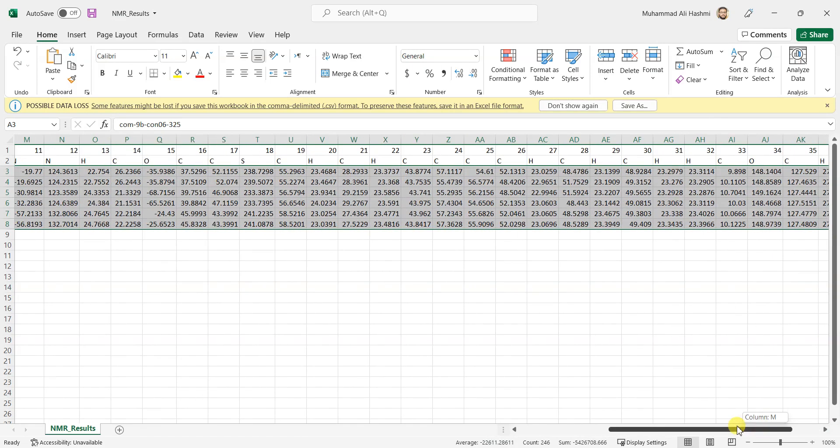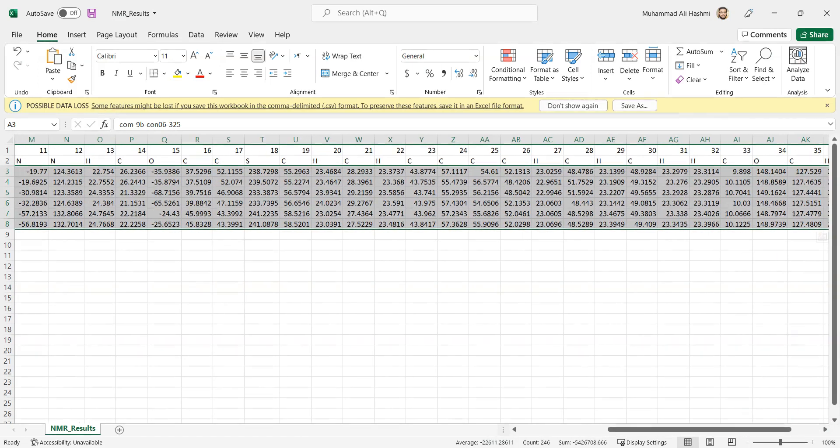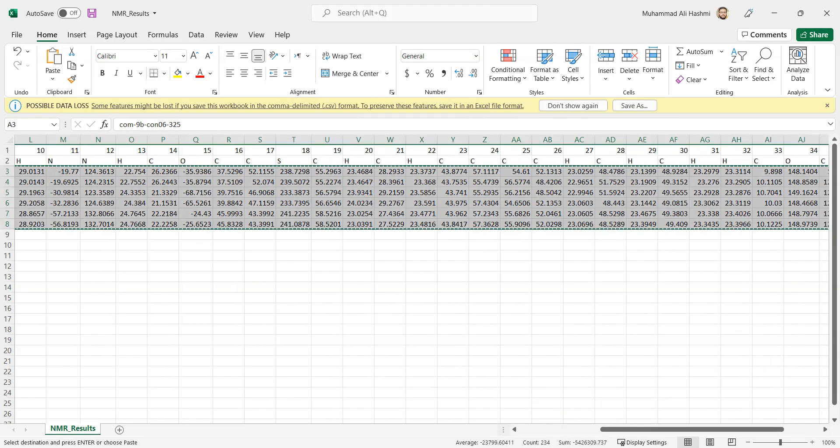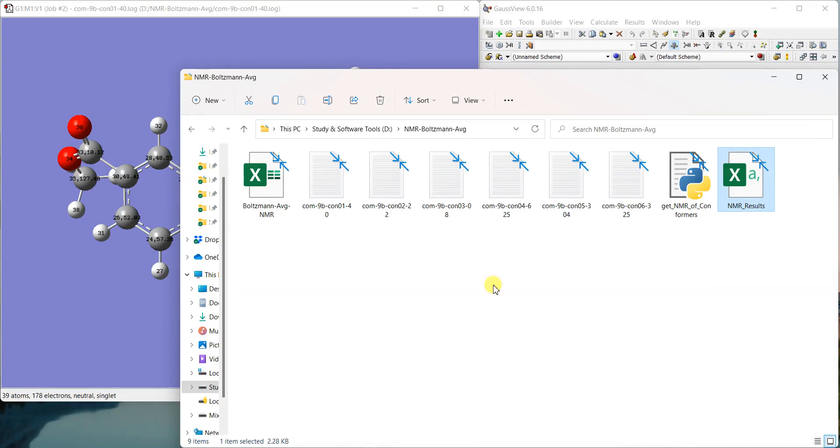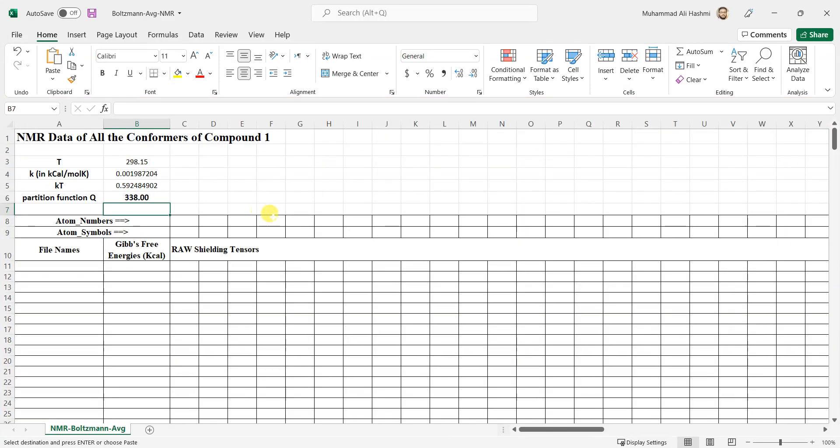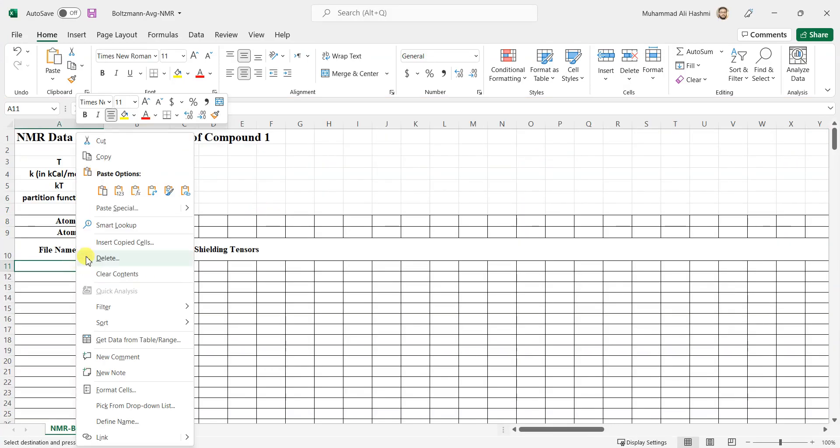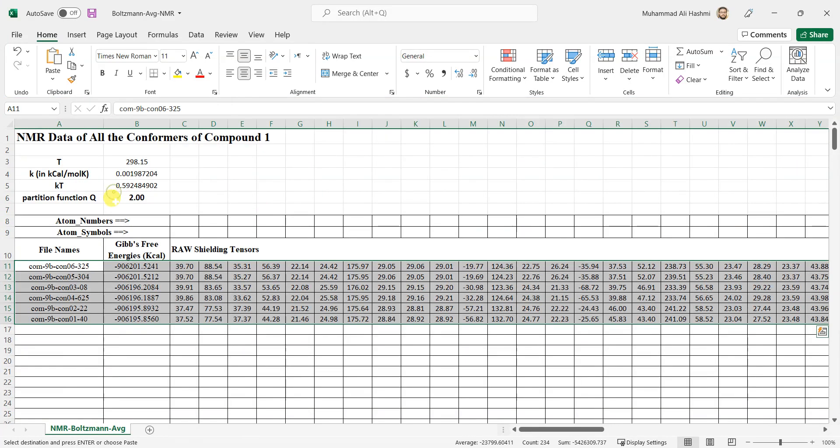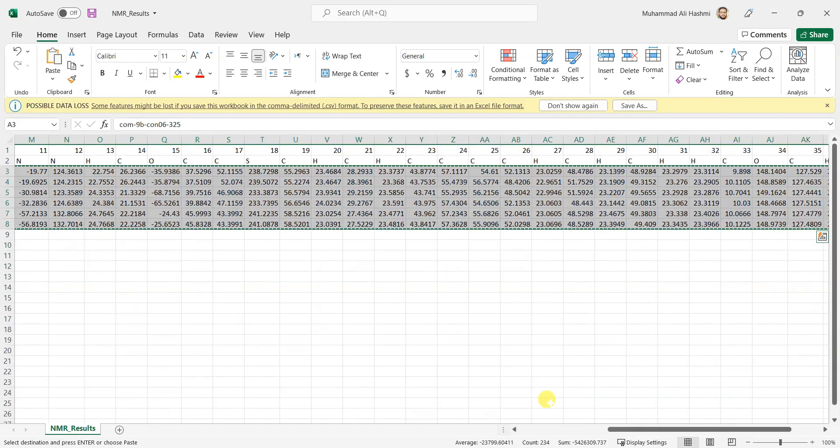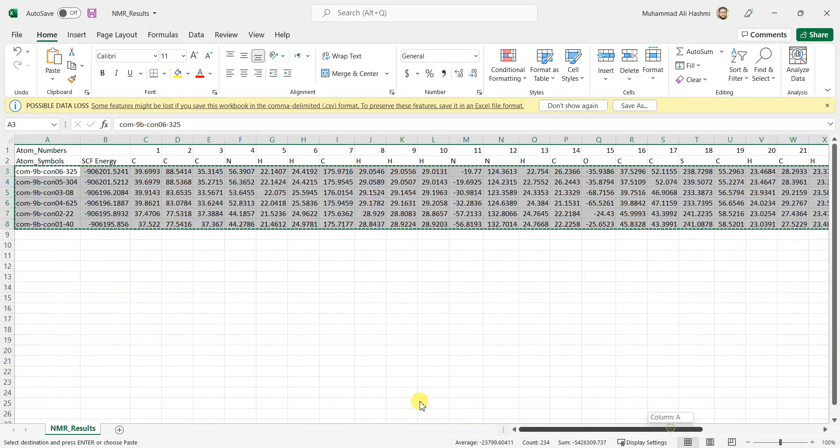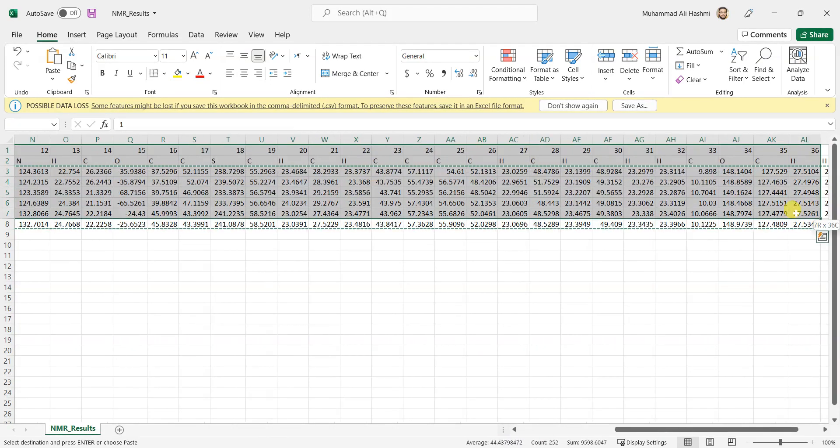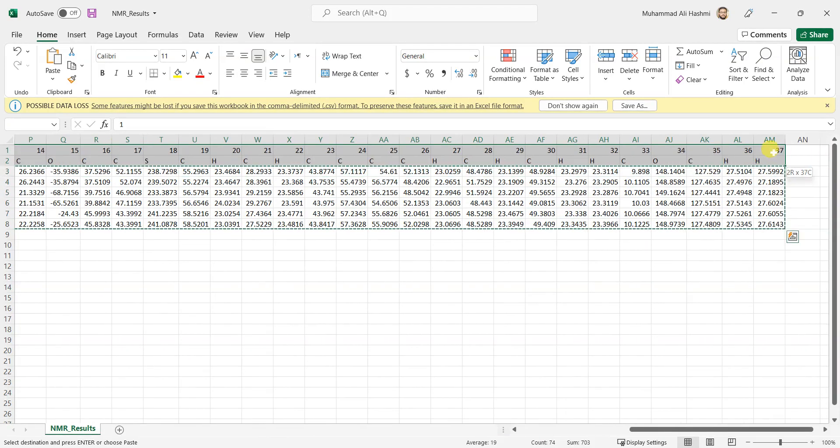Here it is. Now I'll open this NMR Excel file and paste it right here. So I have pasted all this data here, but I just also need to copy the atom numbers and symbols from that file. I'll just copy them now. I'll just copy these.